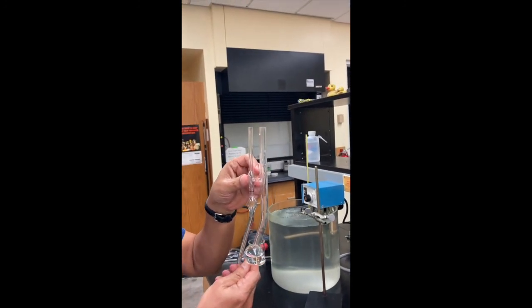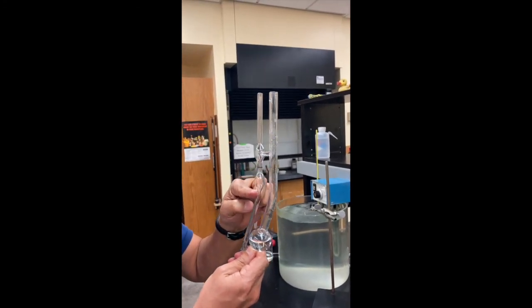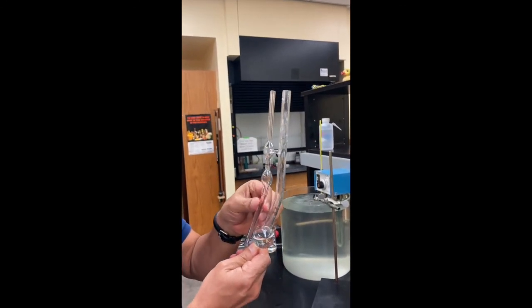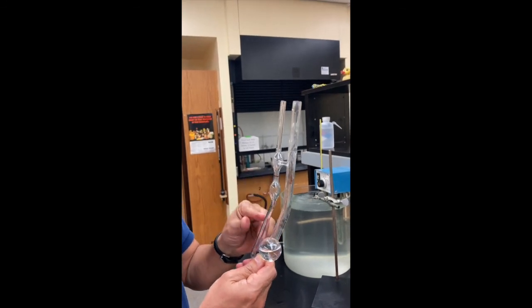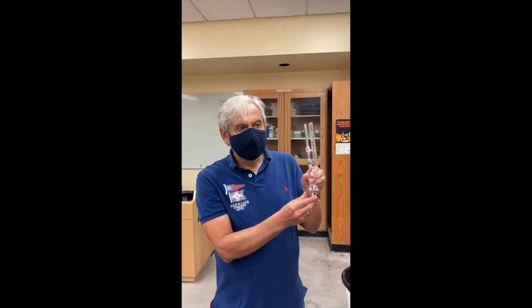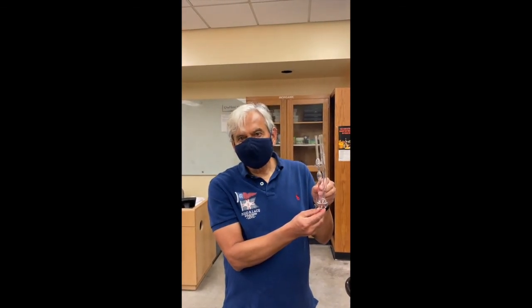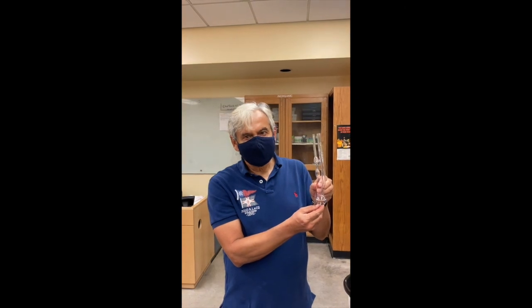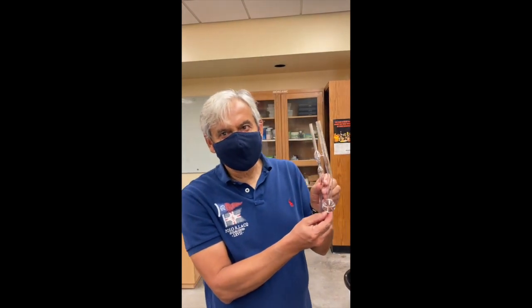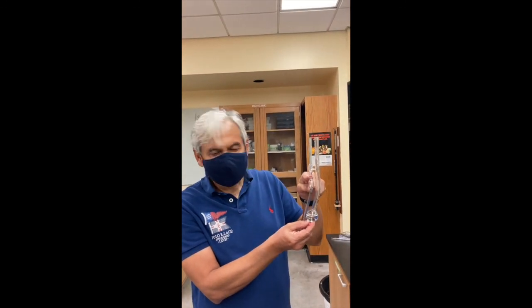Another important thing: when the solution is concentrated, there is a higher probability of clogging the tube and in such a way upsetting the time measurements. Therefore, when you have your 4 solutions ready, it is recommended to measure them in order of increasing concentration and average mass. So you start with the less concentrated cleaved solution, then the less concentrated uncleaved solution, then the concentrated cleaved, then the concentrated uncleaved, so that the most concentrated solution is measured last.